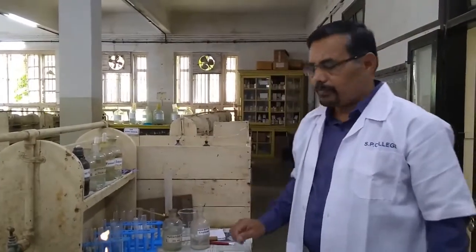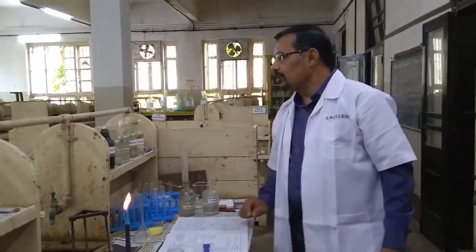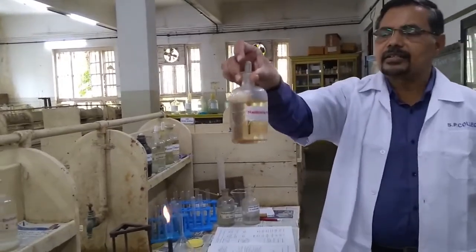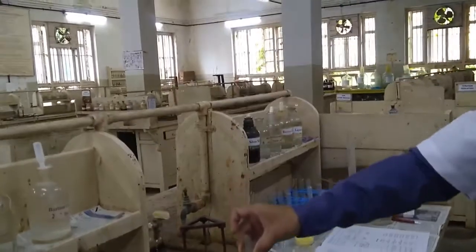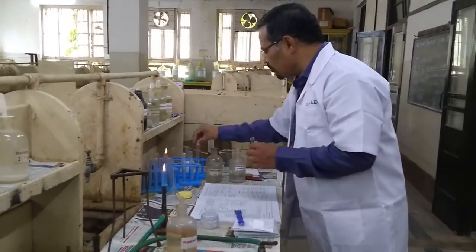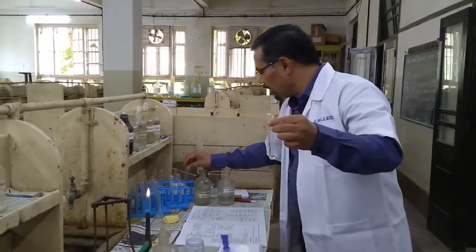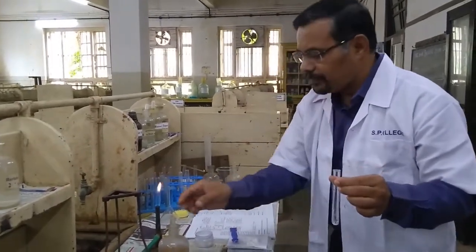Now we will perform the confirmatory test for NH4 plus. For the confirmatory test, we will use Nessler's reagent. So this is Nessler's reagent. It is already prepared in the laboratory. So I will take a small quantity of this original solution in the test tube. Then I will add a small quantity of this Nessler's reagent.